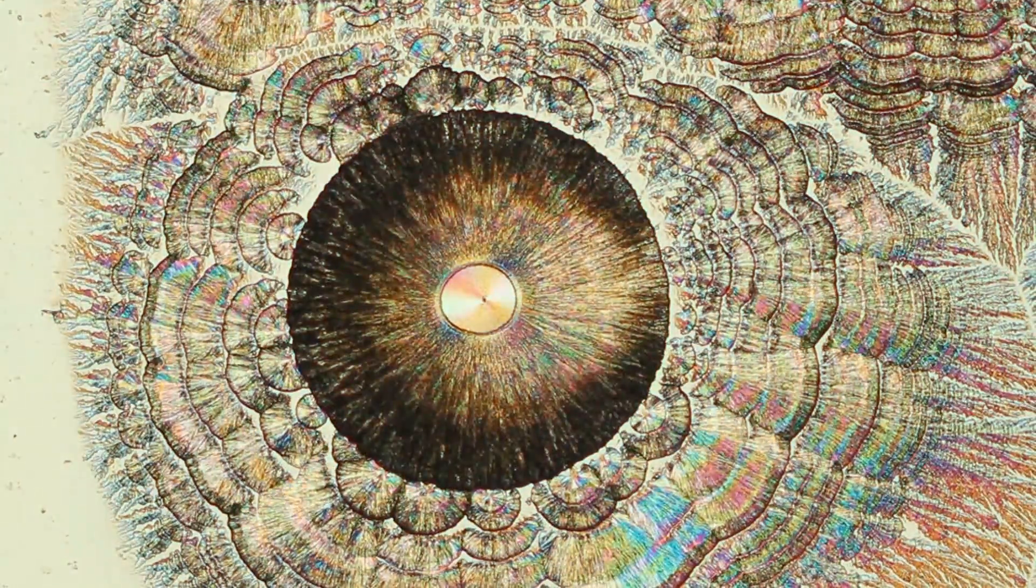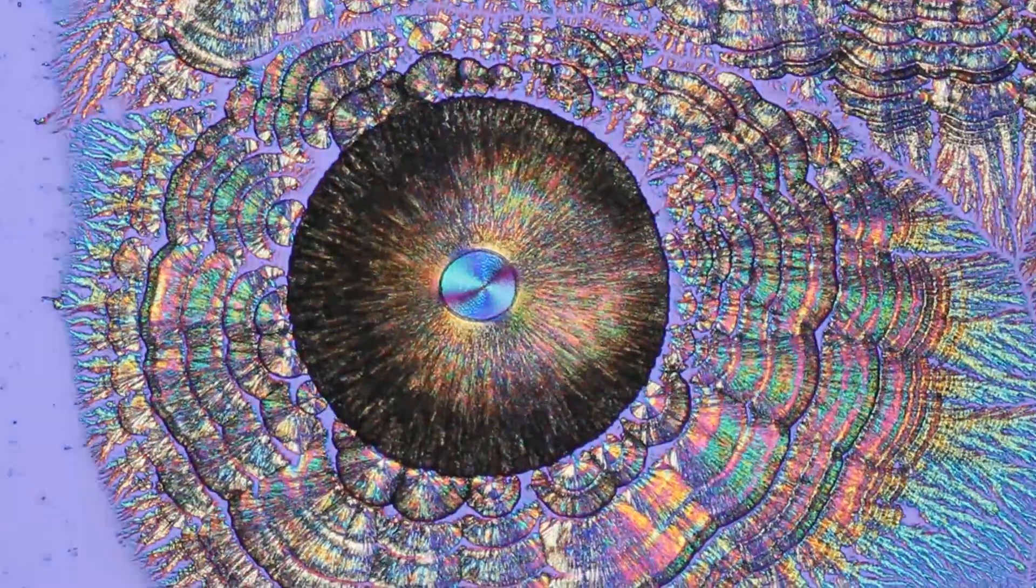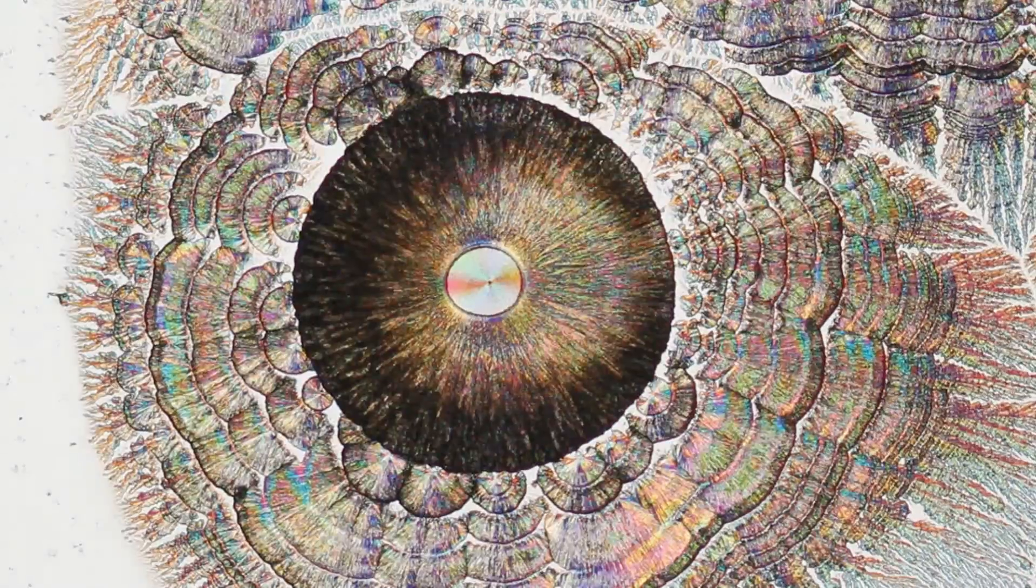Vitamin C just comes alive. The colors, the patterns of crystal formation are wonderful things.